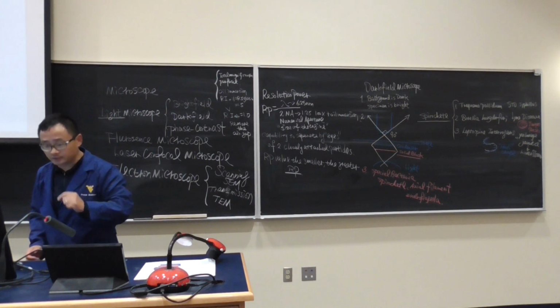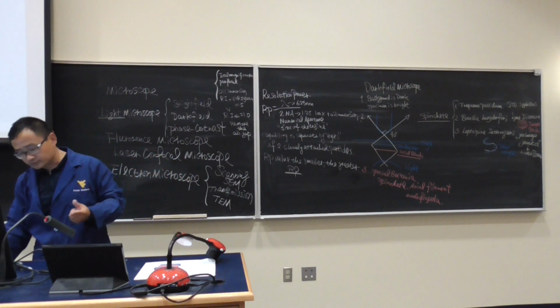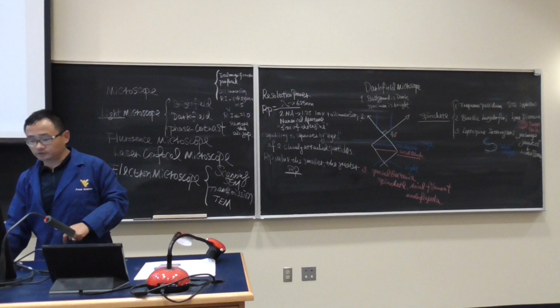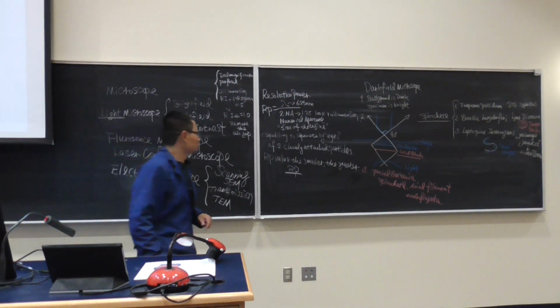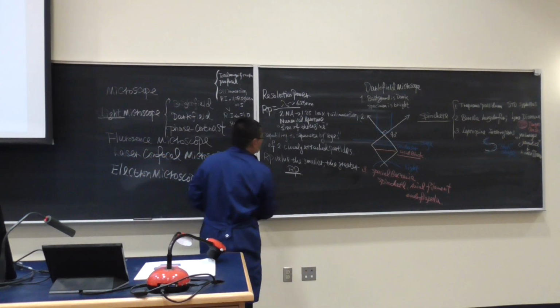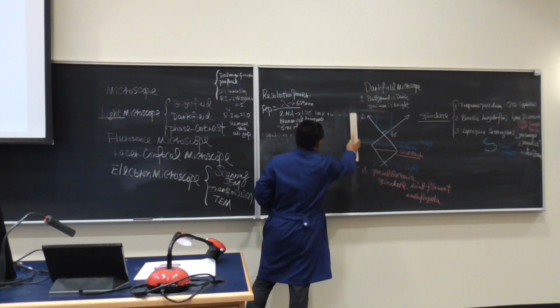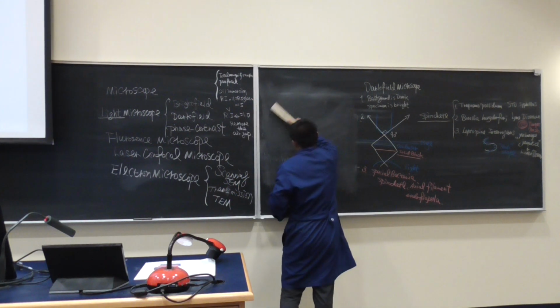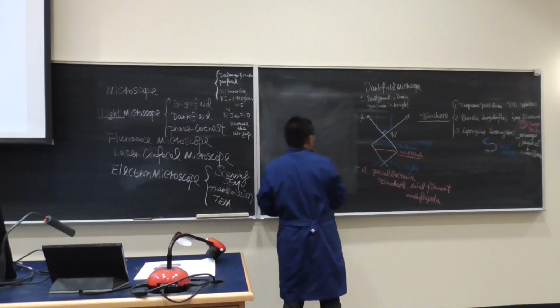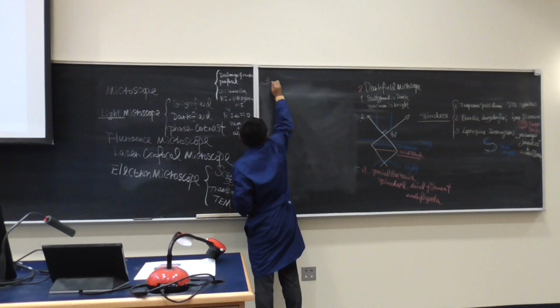This is also underneath the dark field microscope. So the color showing up, the background is dark, the sample is bright. So this is the dark field microscope. Why is it important? That's the reason. Okay, so we're going to move this out. Now we want to talk about the phase contrast microscope. So the third thing we want to mention is the phase contrast microscope.